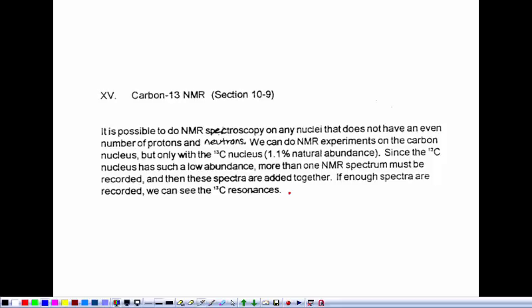All right. So if I'm really going to start looking at molecules and looking at their proton spectra and try and figure out what the structure is, I need a lot more than just the proton spectrum. I'd like to have an infrared, I'd like to have a mass spec, but there are other NMR techniques that will help me.